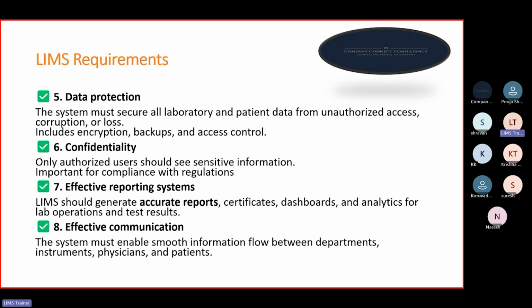Let's say 10 analysts are under his lead. If there are 10 samples or 10 tests, he will assign each test to a different analyst. That communication, or workflow, will be tracked in the software, and it will be easy for him to select the analysts and assign them the tasks.